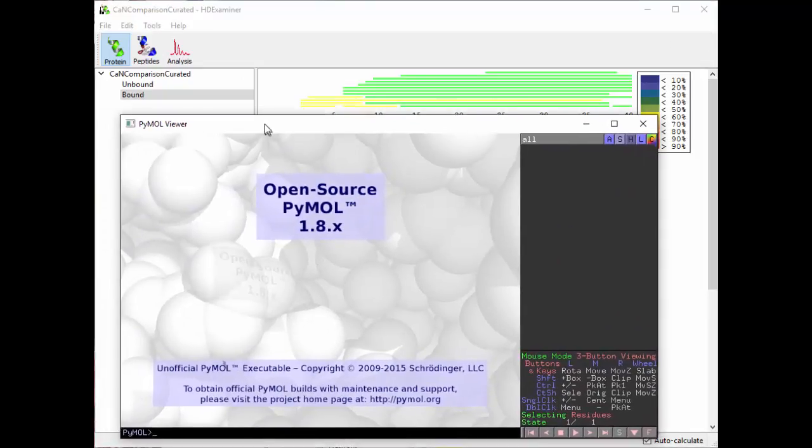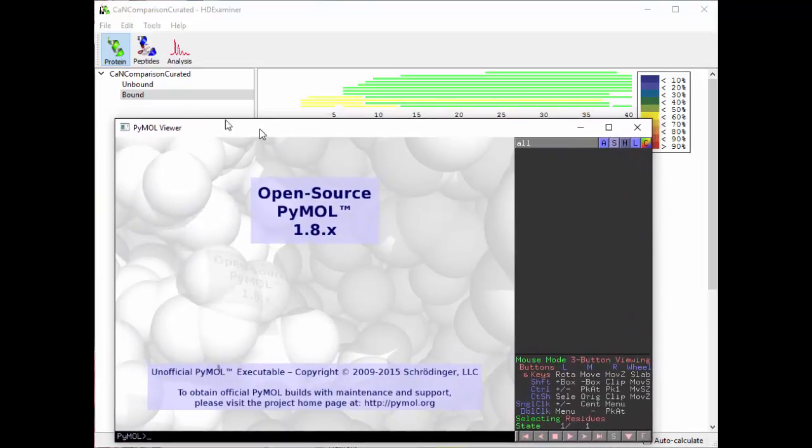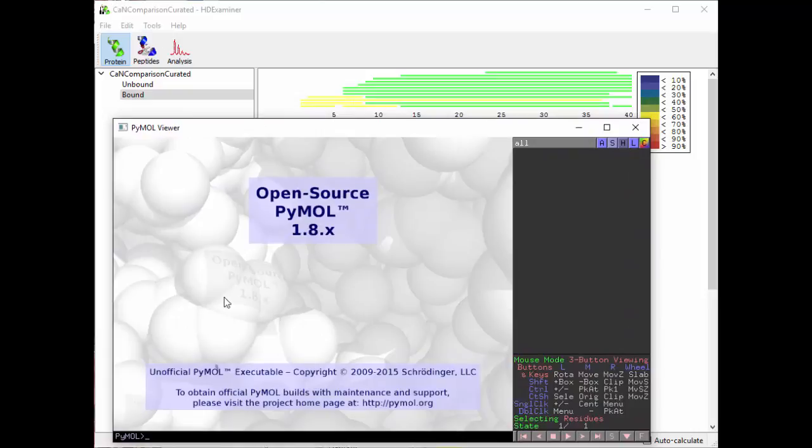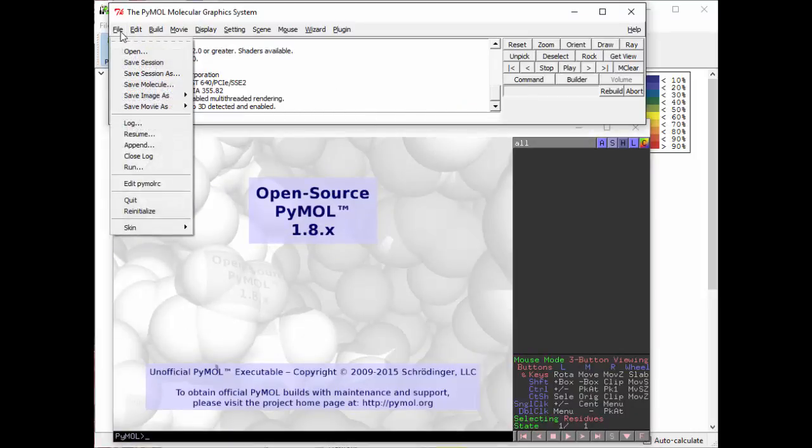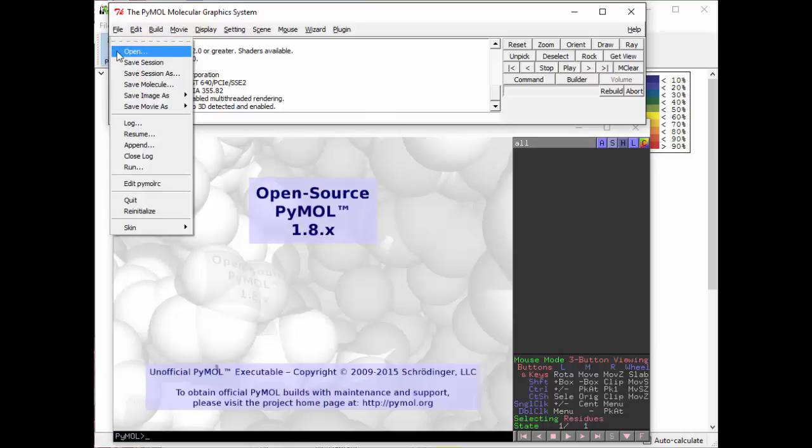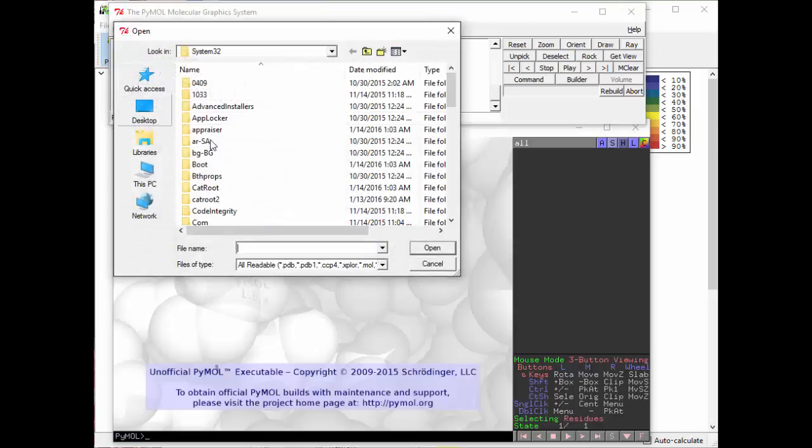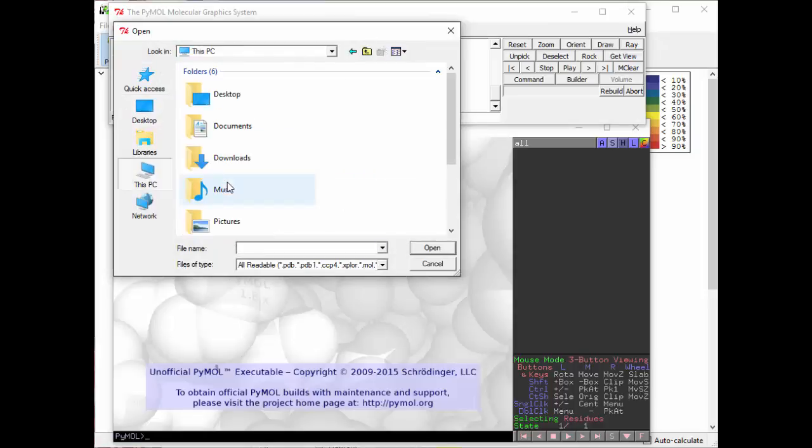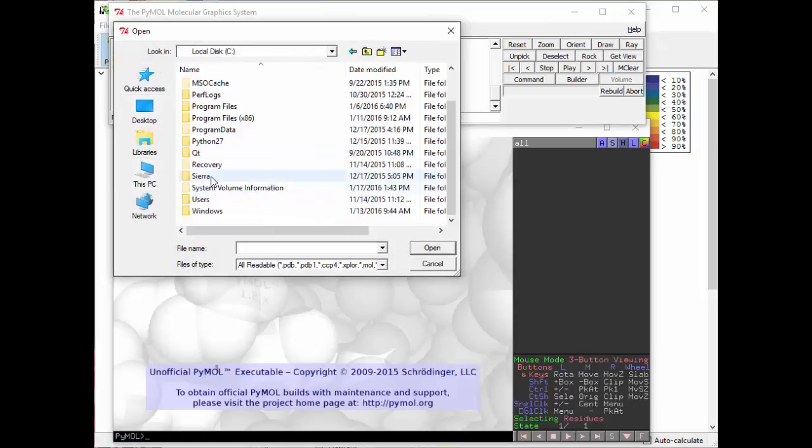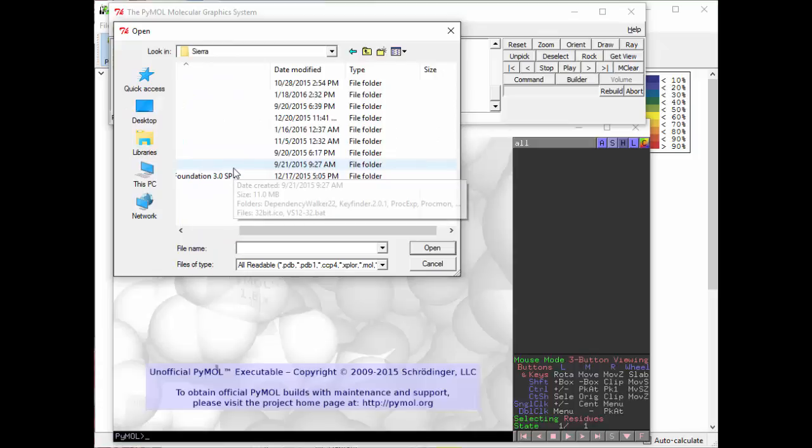So I'm bringing up PyMOL and the first thing to do here is to load my PDB file. PDB is a protein shape format that PyMOL can read. So I'm going to open this, I'm going to browse to the data file.